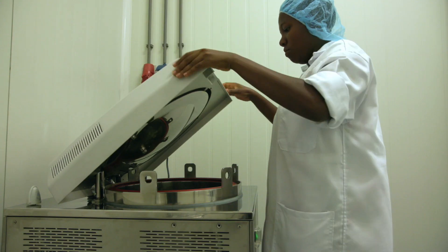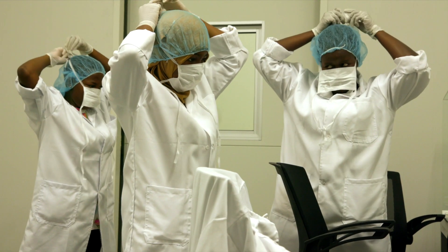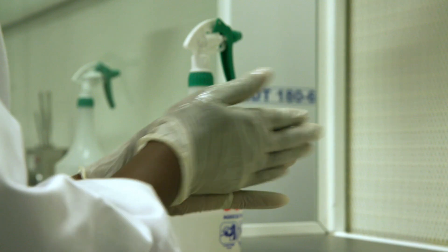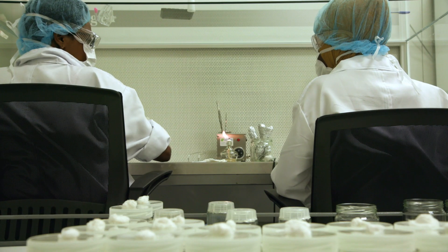The media is then sterilized in an autoclave. In our lab it's essential that we work to the highest hygiene standards. The lab technicians transfer the meristem to the sterilized media.